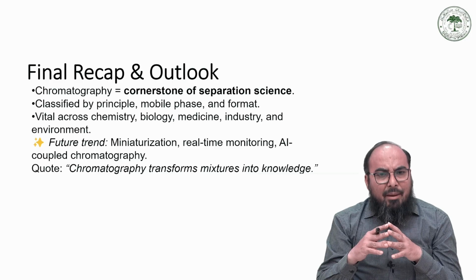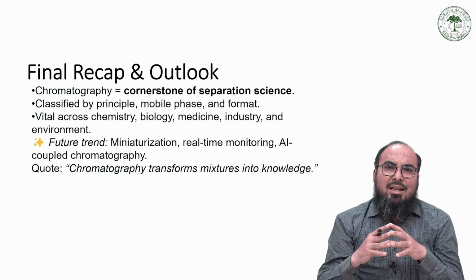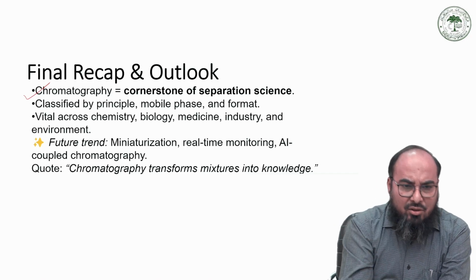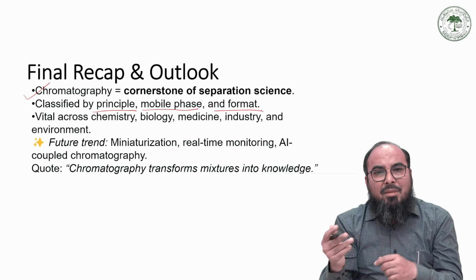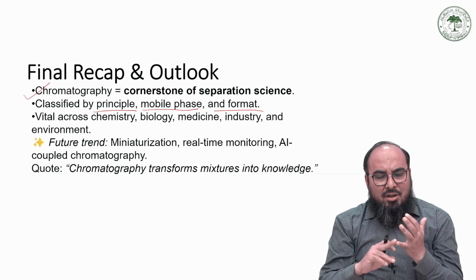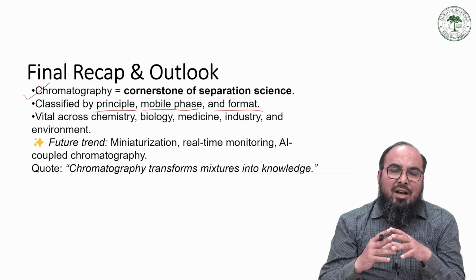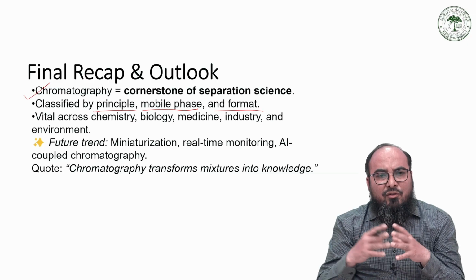Now let us quickly recap and see what we have learned today. Chromatography is the heart of separation science. We can classify the different chromatographic techniques on the basis of principle, on the basis of mobile phase, and also on the basis of format. On the basis of principle, we have classified them as adsorption, partition, size exclusion, as well as affinity chromatography. Similarly, on the basis of mobile phase, we have classified them as gas chromatography as well as liquid, and also classified the format.